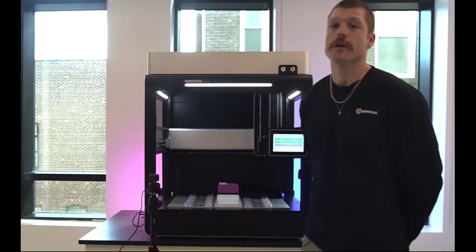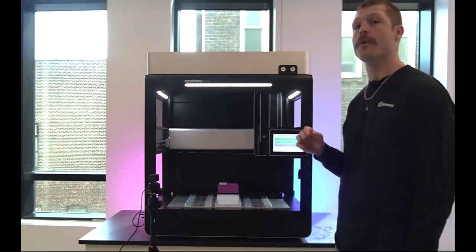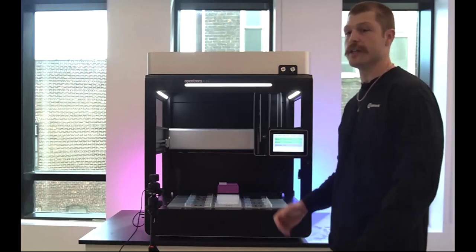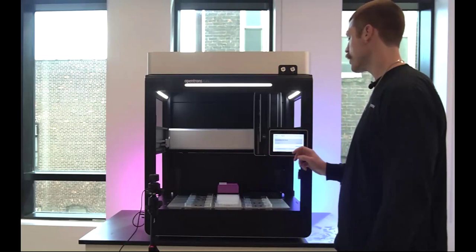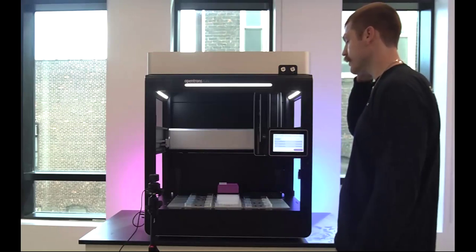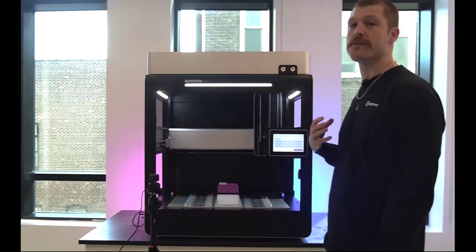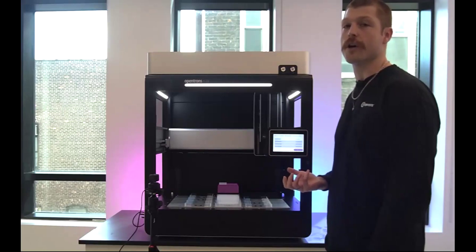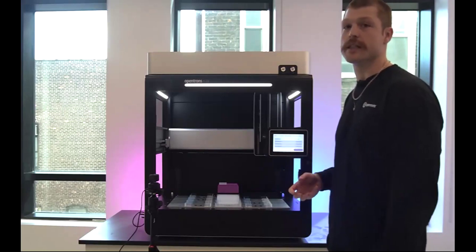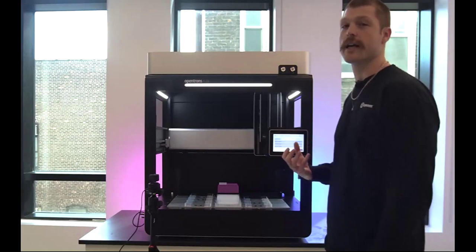same. So just very quickly here, I'm going to walk you through what it looks like on the touch screen to do a quick transfer. Starting from our main screen here, you just click into transfer. This robot, as well as the application that I'm using on my computer, have already been updated to our 8.0 software. This was released last week and is super exciting. It has a great deal of features.